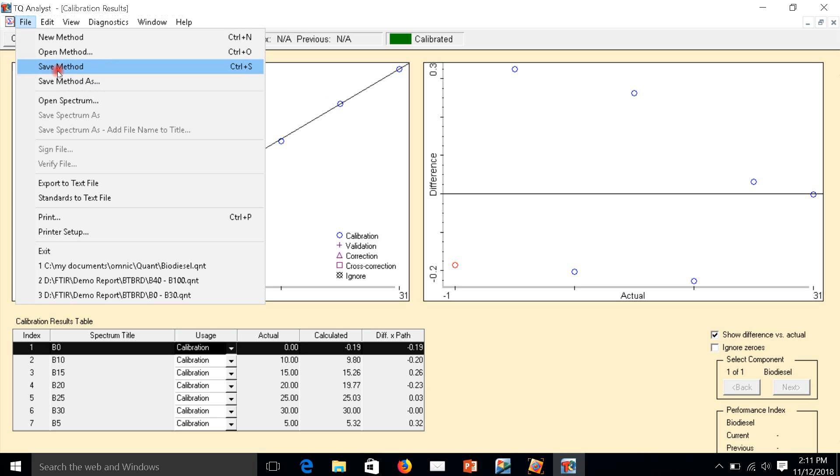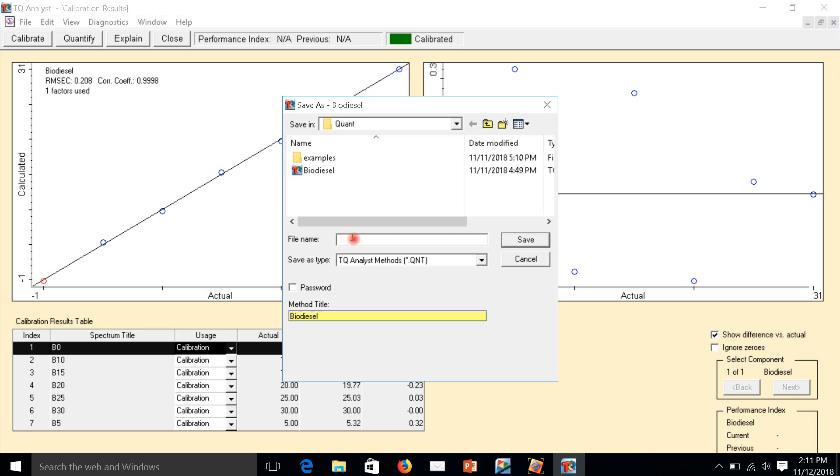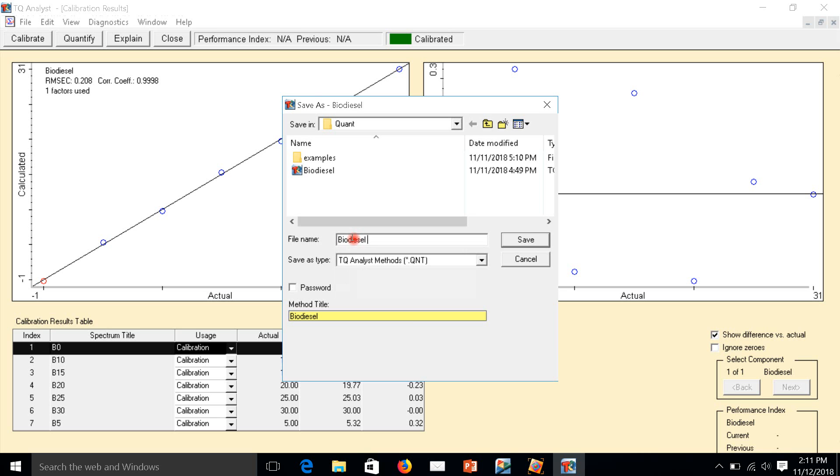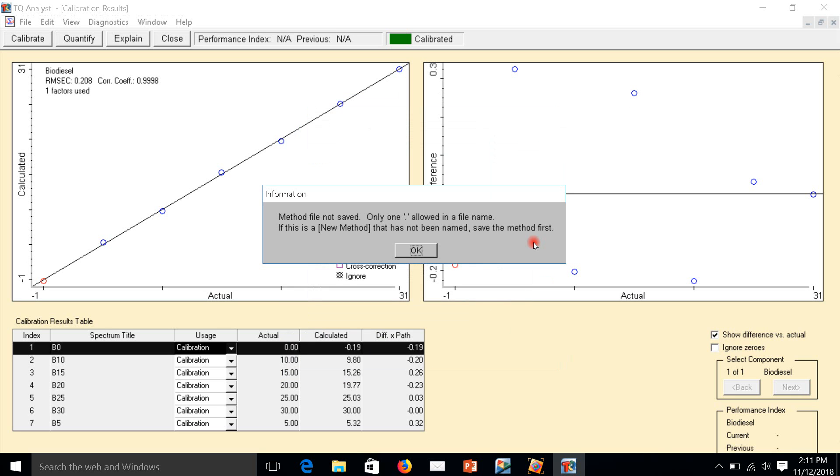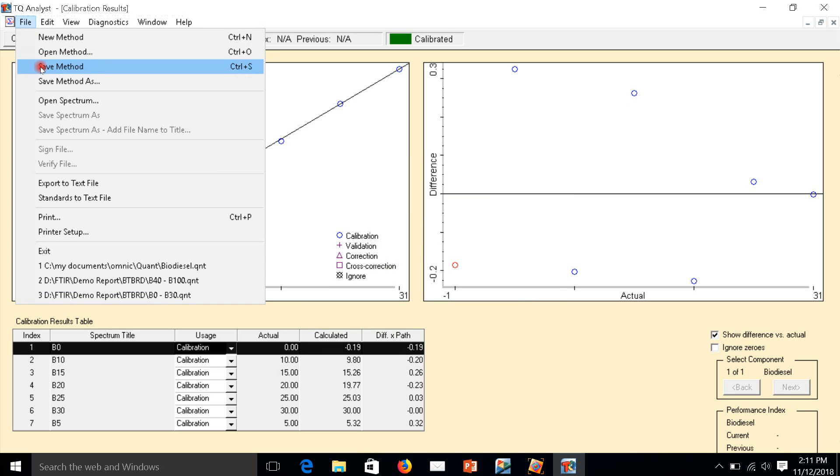Saving the method. This one is already biodiesel, but now I will make biodiesel 0.2. This one we call a quant or a method. It's a method we can edit in the future. Now just saving.